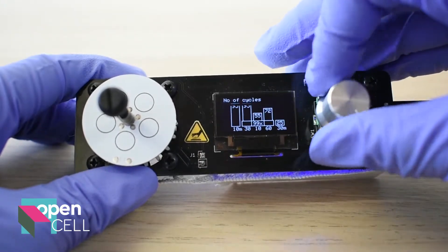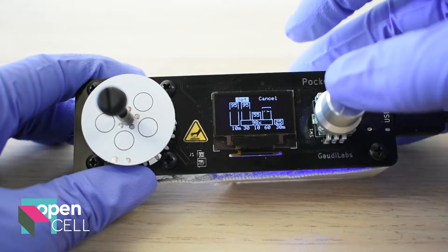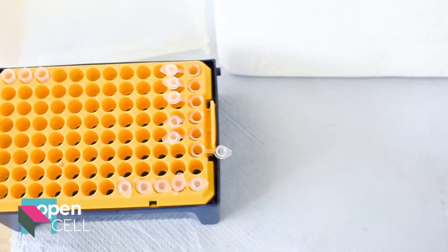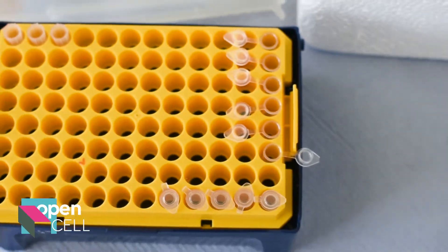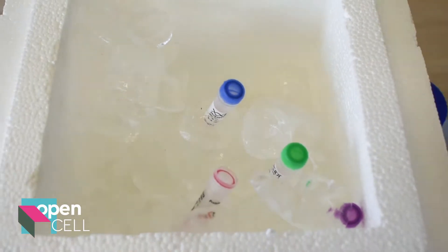I was just seeing how high it can go and apparently it can run up to 99 cycles, which is quite impressive. So now you're ready to prepare your PCR reaction, taking your primers, your enzyme mix and your DNA for amplification.